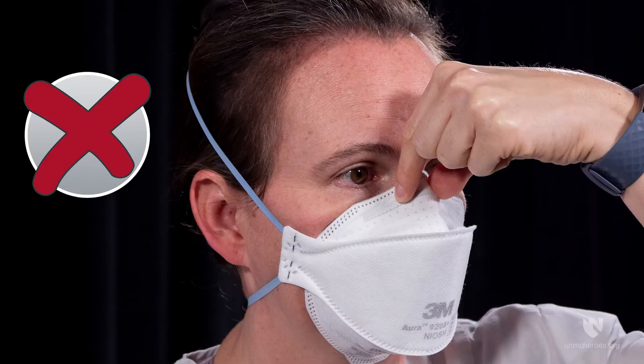Place fingertips from both hands at the top of the metal nose piece. Using two hands, mould the nose area to the shape of your nose by pushing inward, while moving your fingertips down both sides of the nose piece. Pinching the nose piece with one hand may result in improper fit and less effective respirator performance.